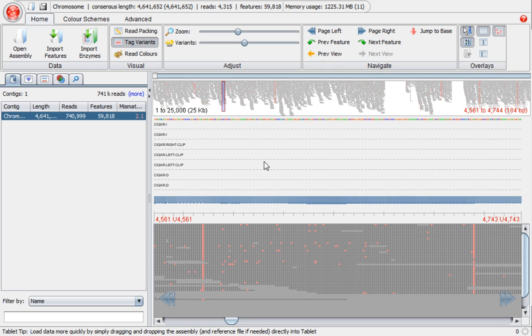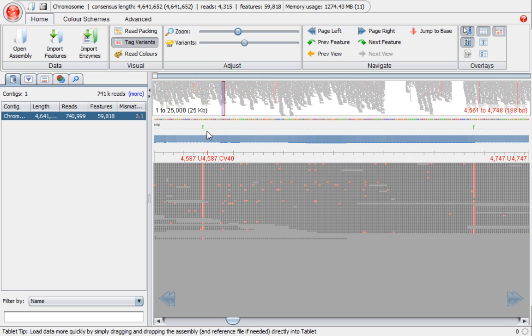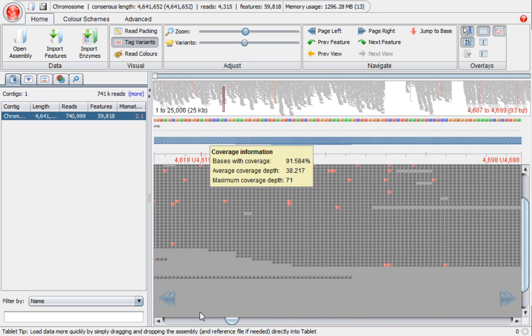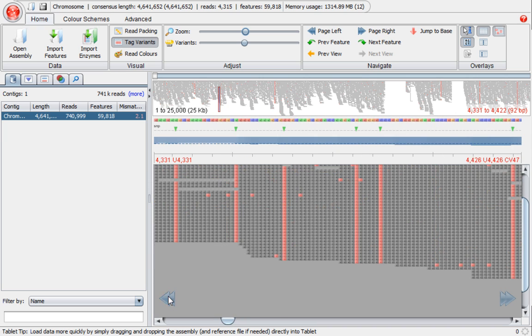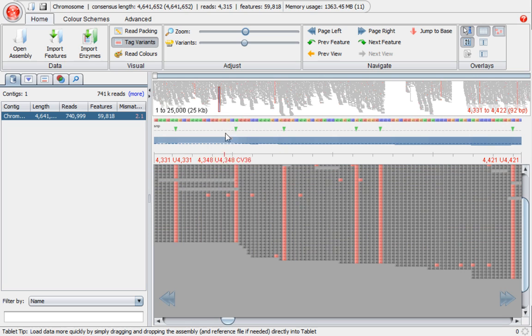I've deselected everything except for snips. So let's click that, and now we see we have a snip track. That looks like a snip. Let's scroll in a bit, and there we go. We can see these various snips, and they're highlighted by green triangles on that track.